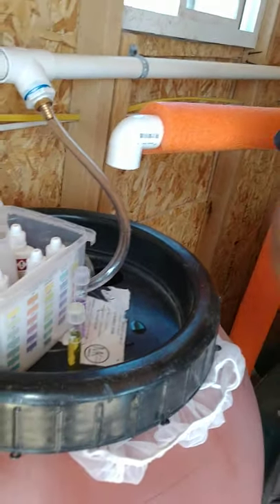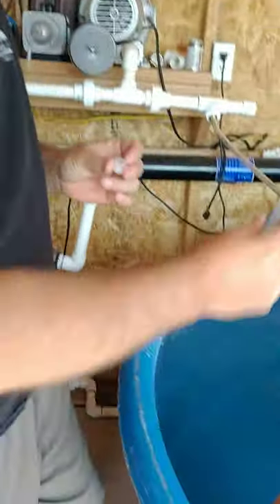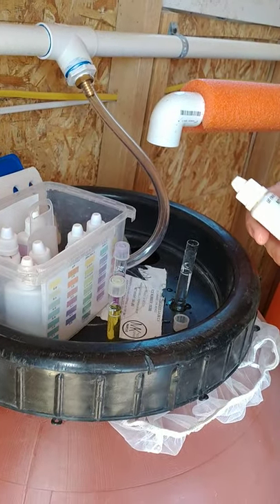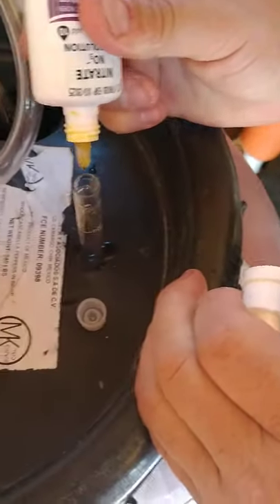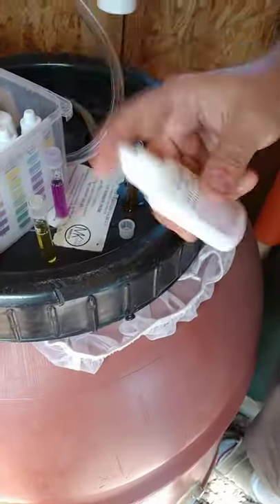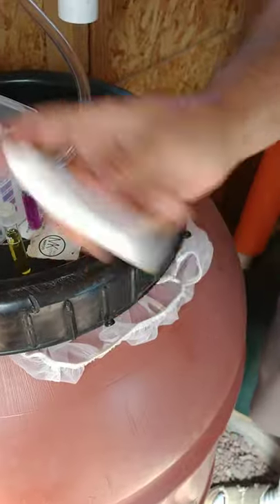Now this is the crucial one — this is your nitrates. Your nitrates are going to dictate how much food your system is getting. So your bottle number one, you're going to shake, and you're going to put in 10 drops. You got to shake nitrate solution number two. You have to shake this for 30 seconds. This is crucial. You'll get bad measurements on your nitrates if you don't shake this for 30 seconds.